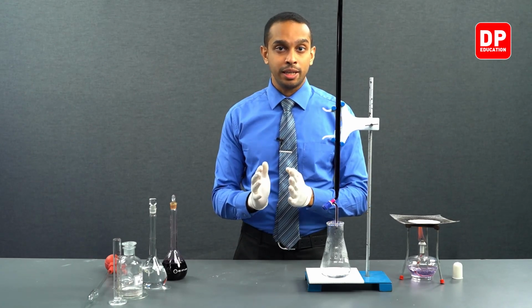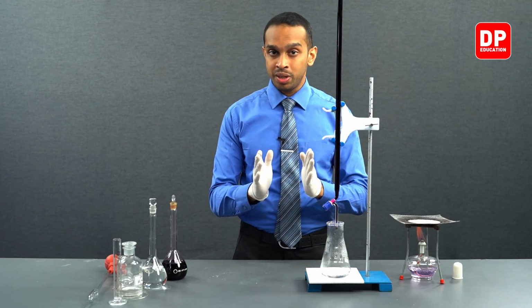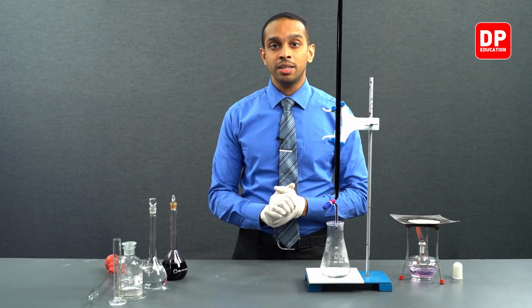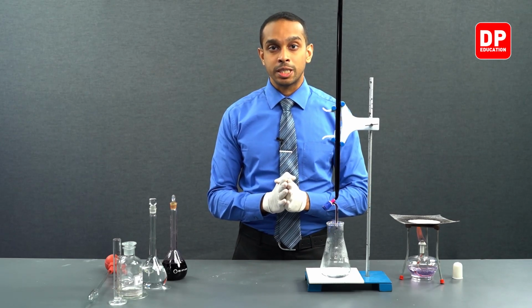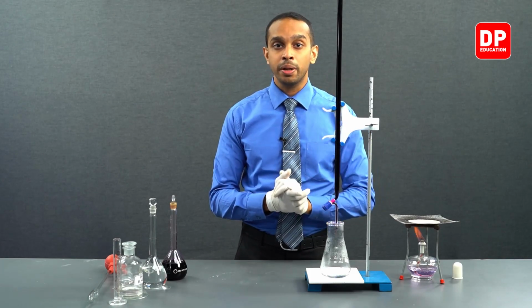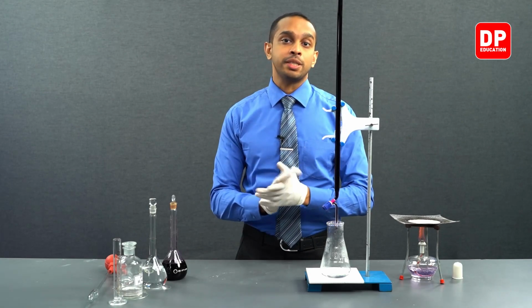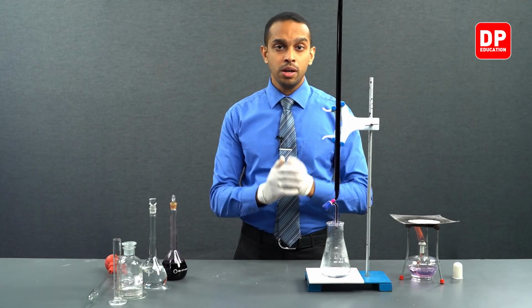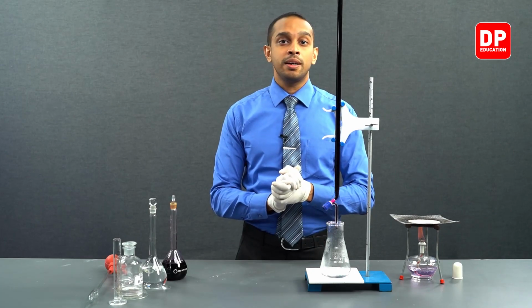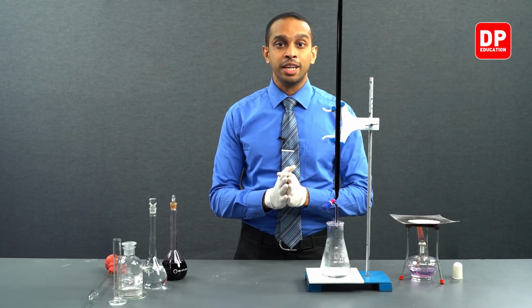So basically, in the previous practicals, we looked at the colors of Mn2 plus aqueous solutions. It is supposed to be a very slight pink color. However, we do not necessarily observe that color in lower concentrations of Mn2 plus. So what we are seeing here is a disappearance of this dark purple color when MnO4 minus ions convert into Mn2 plus ions. When this is happening, since MnO4 minus is a good oxidizing agent, it oxidizes the oxalate anion and converts it into carbon dioxide.